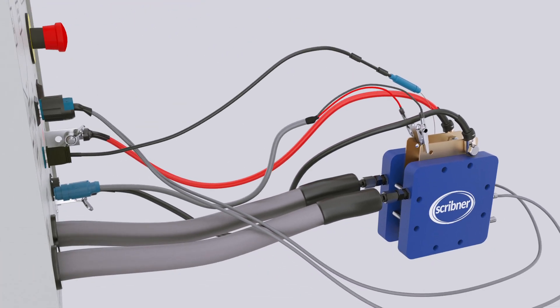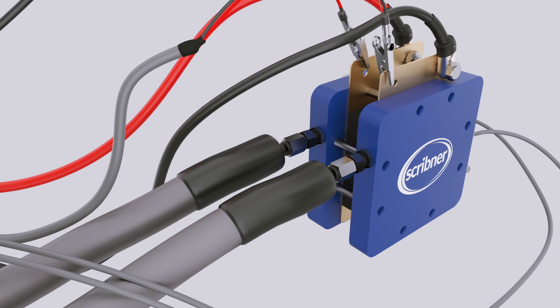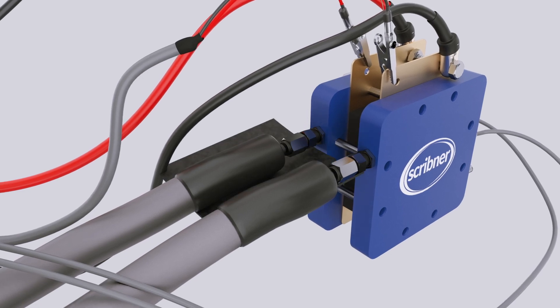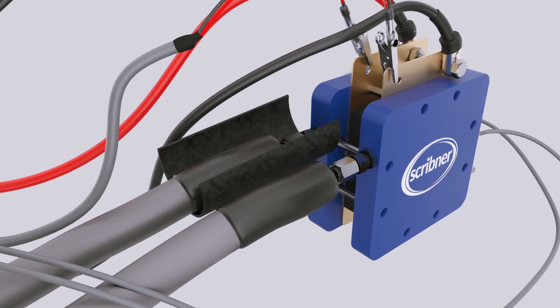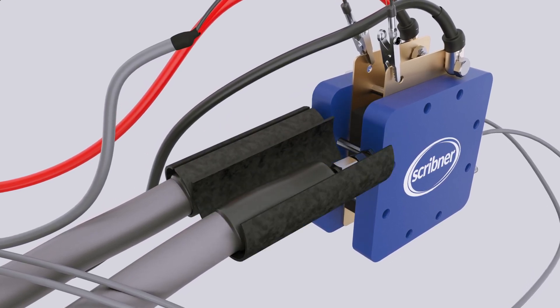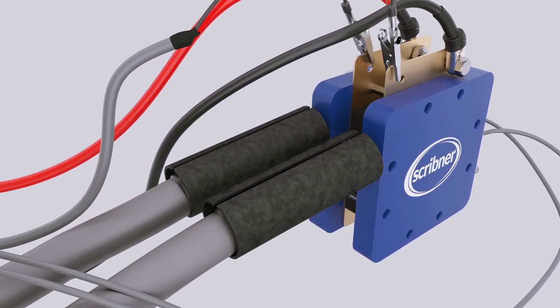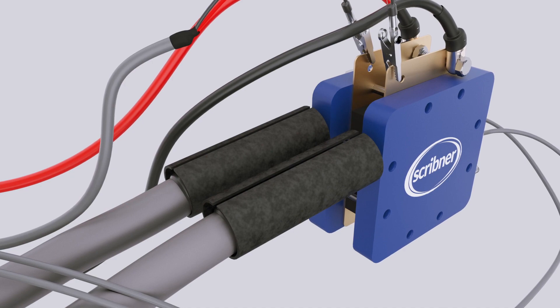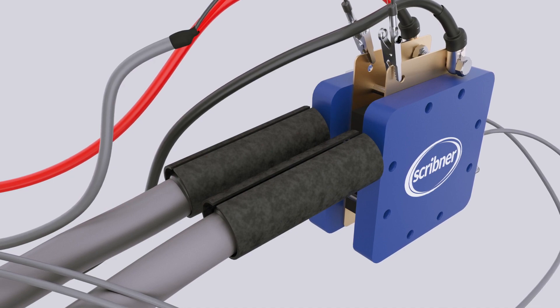Cell fixture connections are complete. Install the heated cuffs, which prevent cold spots and water condensation at the junction between the 850 heated lines and the cell fixture inlet.